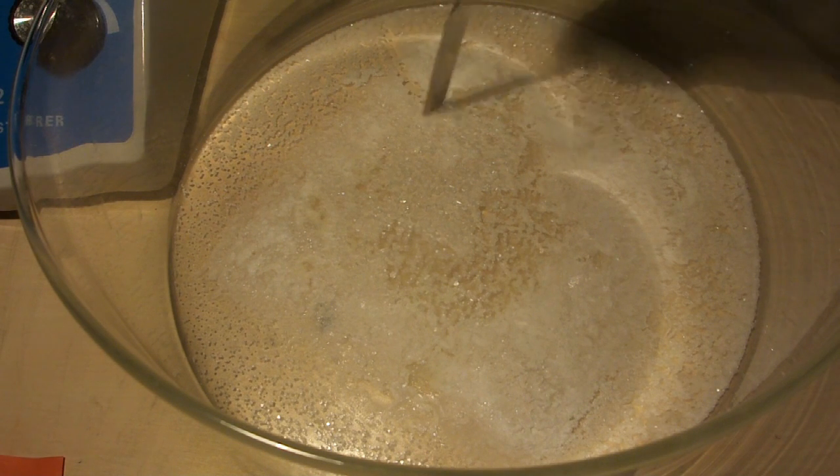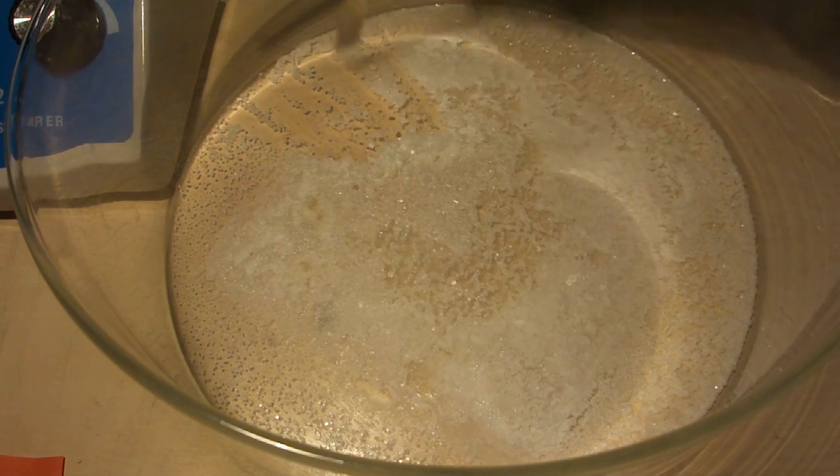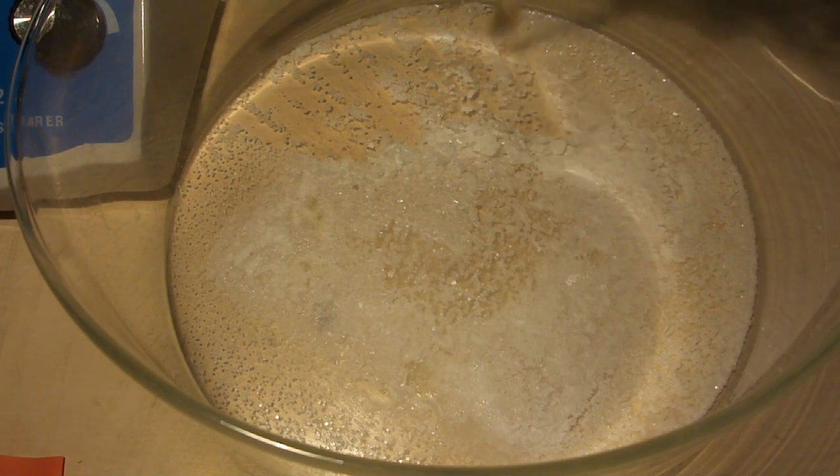After evaporating the solution, we are left with nice crystalline barium nitrate. We scrape it out from the evaporating dish and transfer it to a bottle for storage.